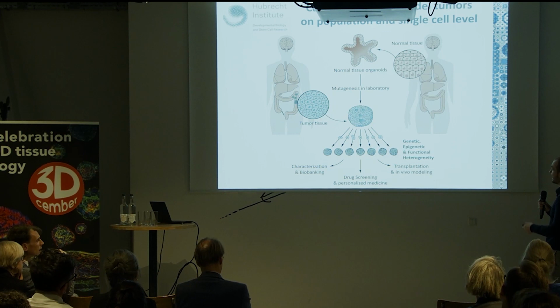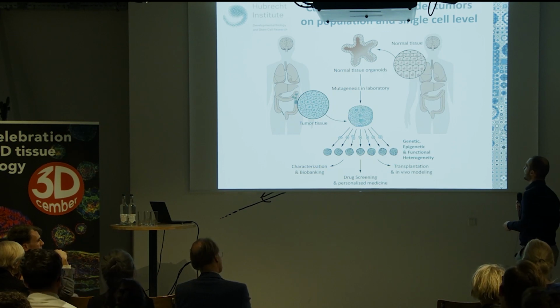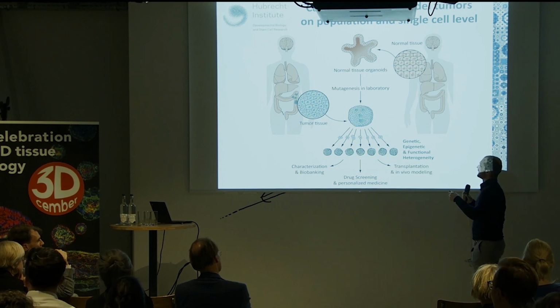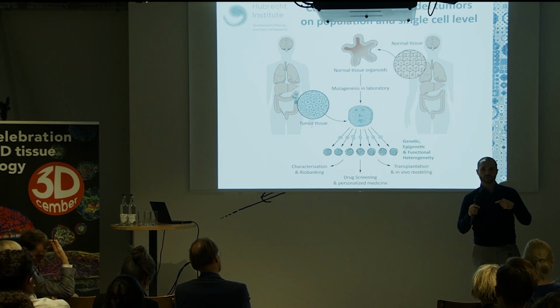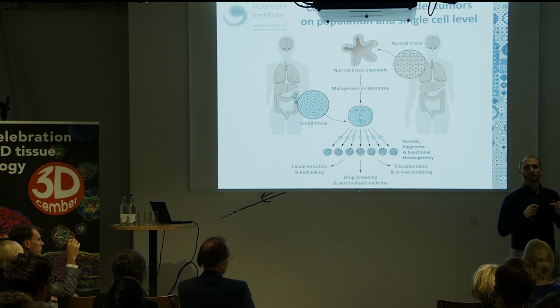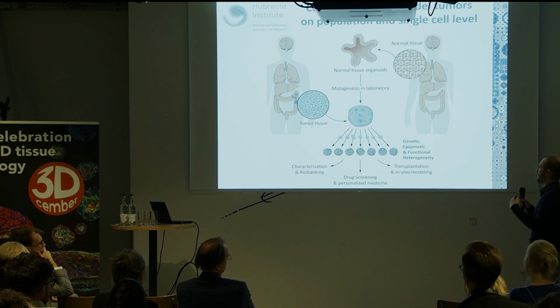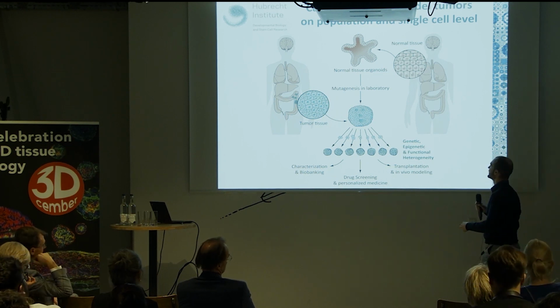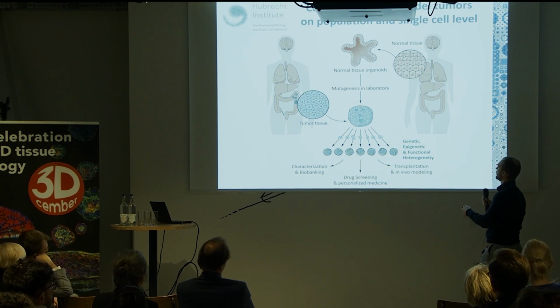So what we can do, and this is work that has been mostly done by Nobu Sasaki in our lab, is he took a tumor, he took biopsies from these different regions of this tumor, he took all of that as organoids in culture, he made subclones from these individual biopsies again, and then studied the clonal lines that he derived from this on a genetic, on an epigenetic, and on a functional level.